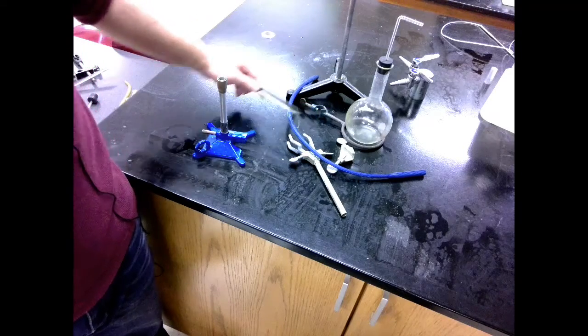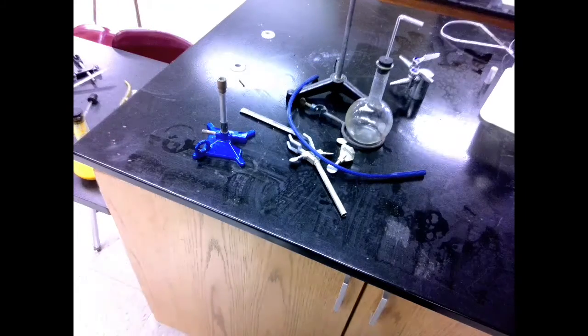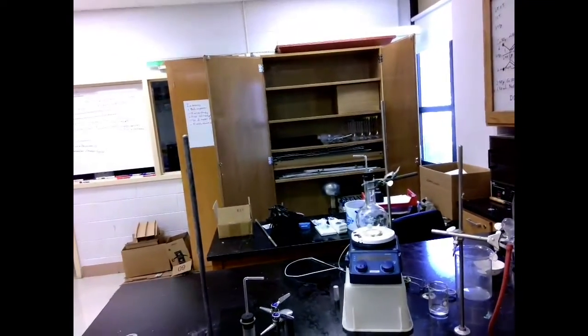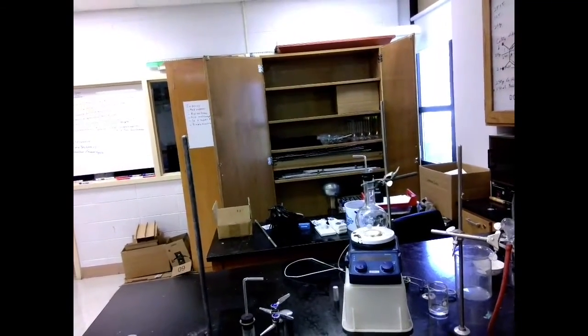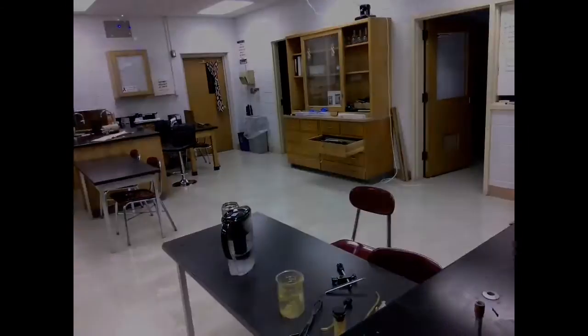These ring stands can be found in a couple places. Spare ring stands that fit into the tables can be found in the organic chemistry cabinet, and the sturdier ones that sit on the table can be found in that drawer that's open there.